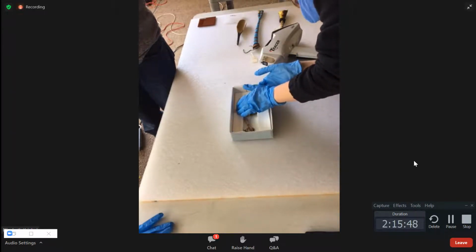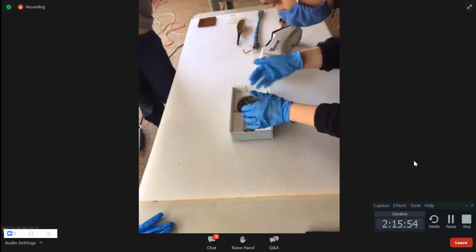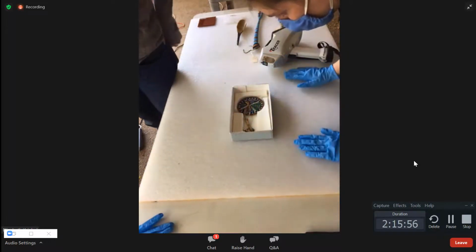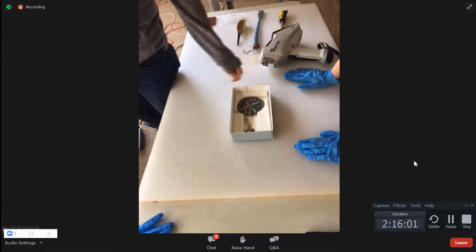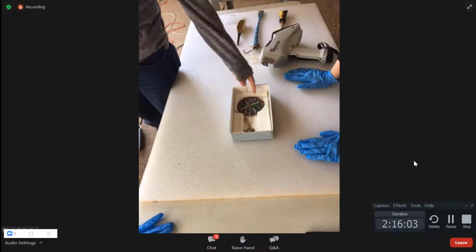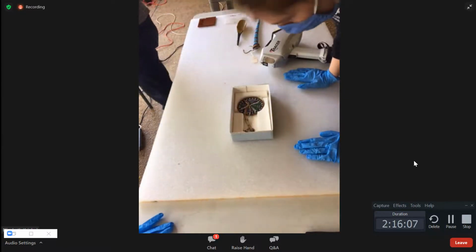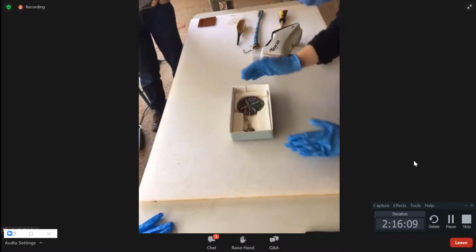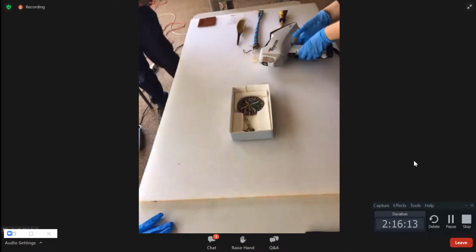Let me see if it's also beaded on the back. We'll measure the beads through the back. Okay, that's the problem. It might be that we can't do much with this. I don't think we can measure the outside without getting the beads. We can measure the tassels though. Okay, so let's do that. I want to keep it in the box. Yes, the tassels seem really fragile. I think it's possible.